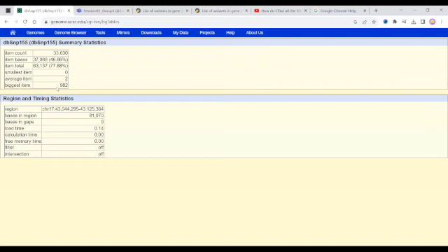Do you have any questions about group one, like how many SNPs are theoretically available? Did you get a clear picture? Yeah. Pardon? In the track, why do we choose dbSNP 1, 2, 3, 4?